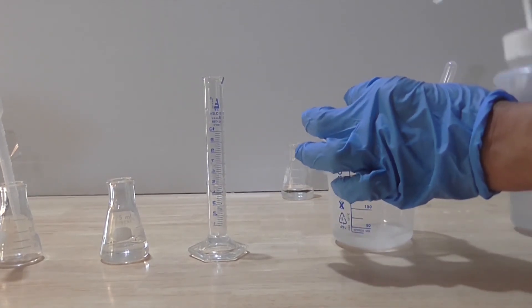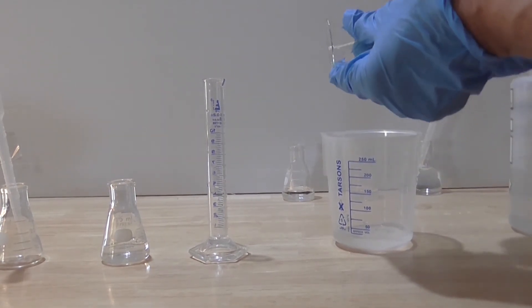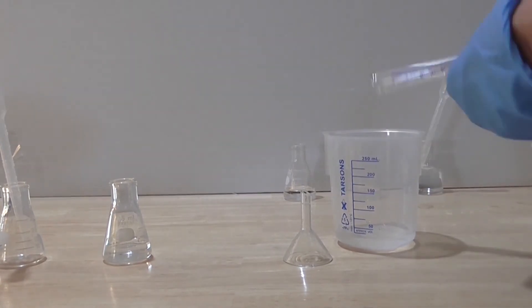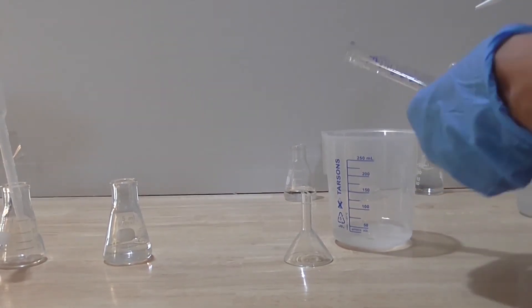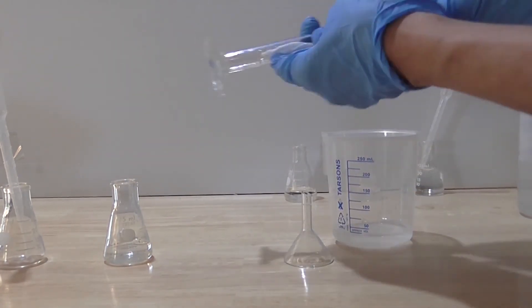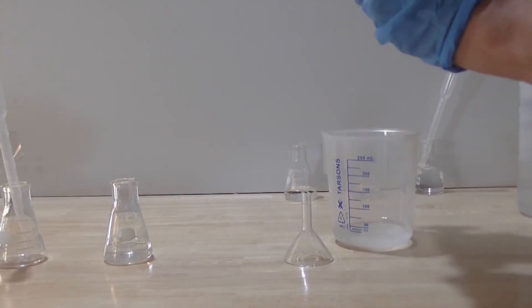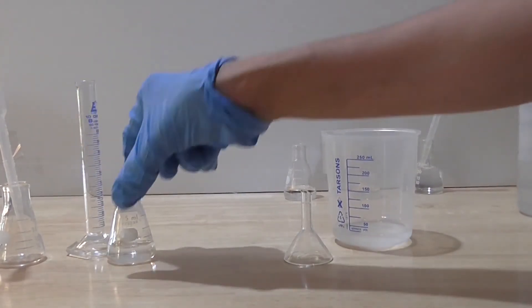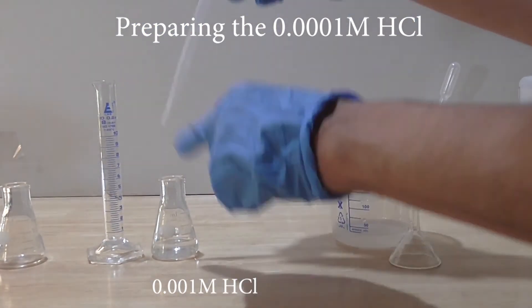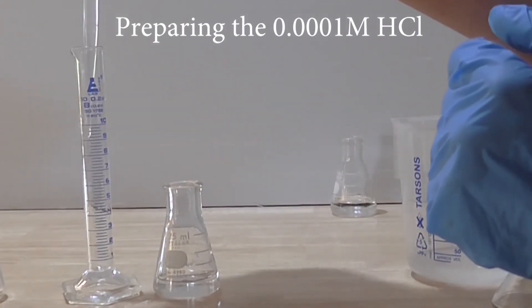Once again, wash and dry the cylinder and glass funnel. Pipette in the standard 1 ml of the 0.001 molar acid into the clean, dry cylinder.